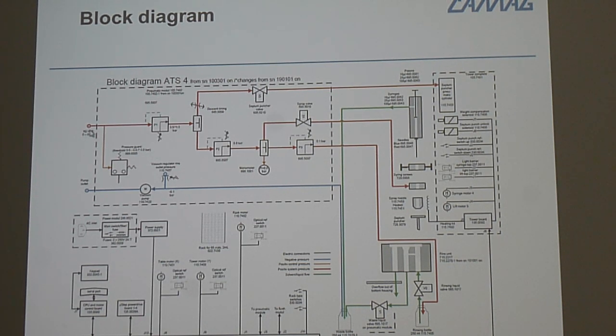We have here the nitrogen inlet with about 5 to 6 bar. Then we have here the pressure guard, which is detecting a window from 3.5 to 3.8 bar, because we have two different models. This is the old model with 3.5 to 3.8 bar, and the new has 4.8 bar. If you are at the borderline, then it gives a signal for the pressure, "connect to gas", which will appear on the display.